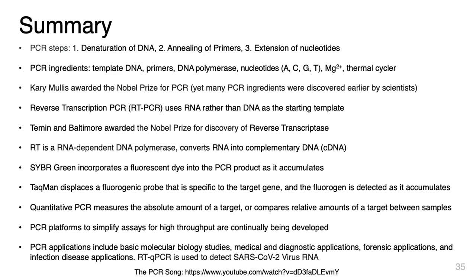qPCR actually measures the amount of the target or can compare relative amounts of targets between samples. There are PCR platforms now that can simplify assays for high throughput, and these are continually being developed. PCR applications include basic molecular biology studies, medical and diagnostic applications, forensic applications, and infectious disease applications, such as the detection of the SARS-CoV-2 virus.